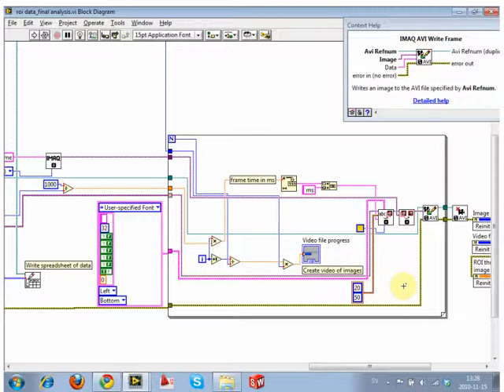Leaving it as raw as possible means that we never have to save the images, because they're all bitmaps, just a bitmap stack. So we can extract a frame from this video, and it's exactly the same as if we saved the file and the image. You can treat it as, rather than a real AVI file, just a folder that you can play. At any point you want to extract a frame, you can open it up in VDub and extract the frame. You could save all of the frames if you so desired, but what I've learned is it's pointless. Because it's an uncompressed AVI file, it has all of the data in it. There's no point for us to save all of the files too.